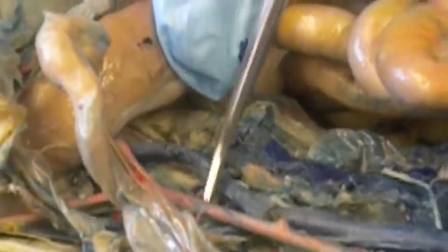Most of the time, it branches like right where the arteries do. But even if it was on a different cat, it'd be the same scenario. That's internal, this is common, and past that is external. Okay. So this would all be external, so it branches off here. What would that be? That'd be the deep femoral.